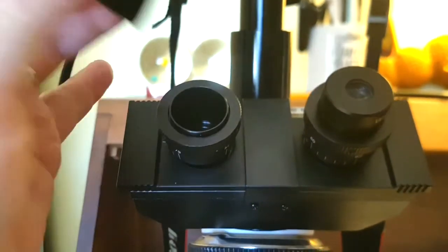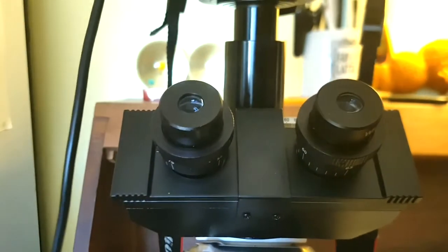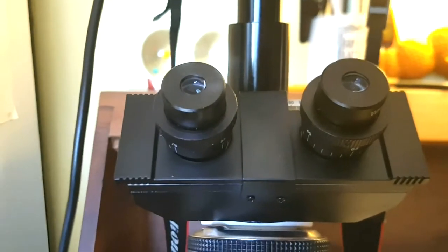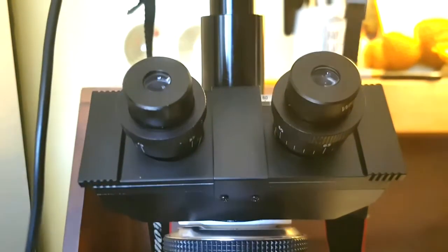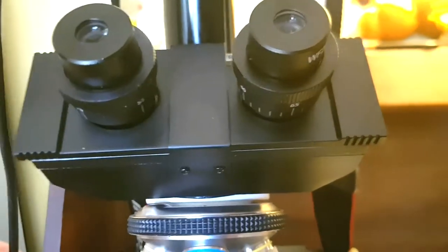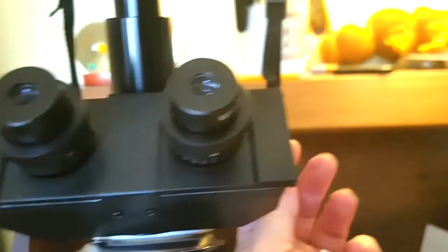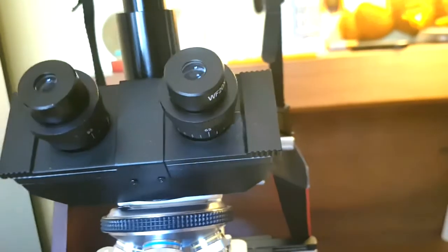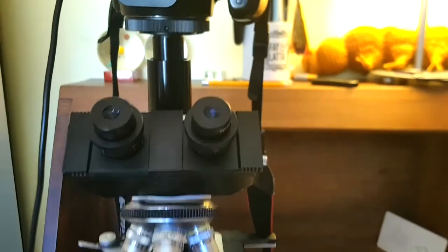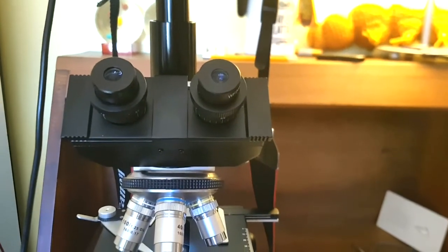I could do that on my old one, but I had to take out one of the eyepieces here and pop that in place, and it was a real faff having to keep taking the camera off and then putting it back on and then taking it off. So now, with one lever over here, I can just basically move some light up to the camera so that I can switch between the two of them. So let's get started with prepping the sample.